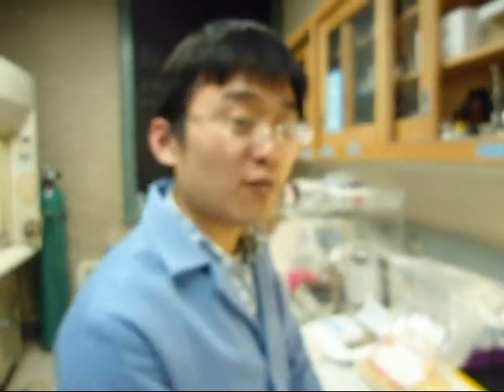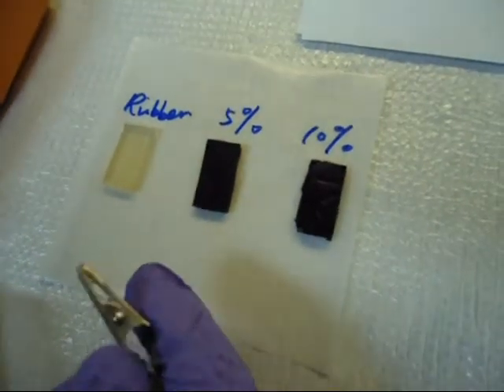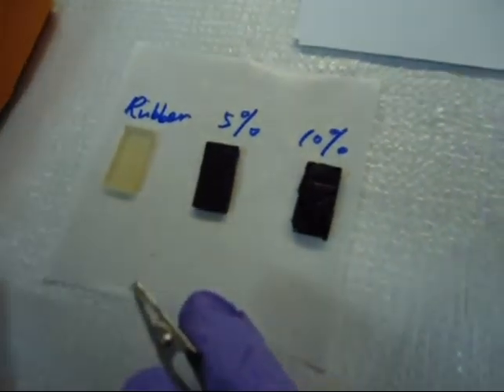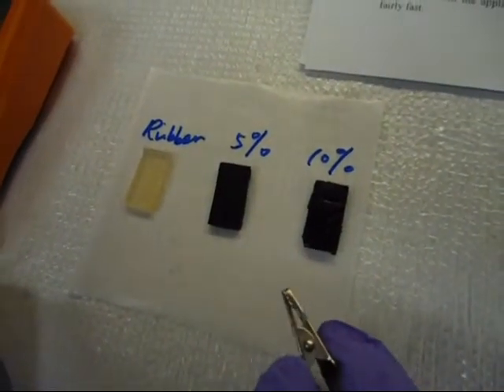Now, we have used hot press to make the sample bars. Here are three sample bars. The first is intrinsic rubber. The second is with 5% of graphite added into the rubber. The third one has 10% of graphite added into the rubber.